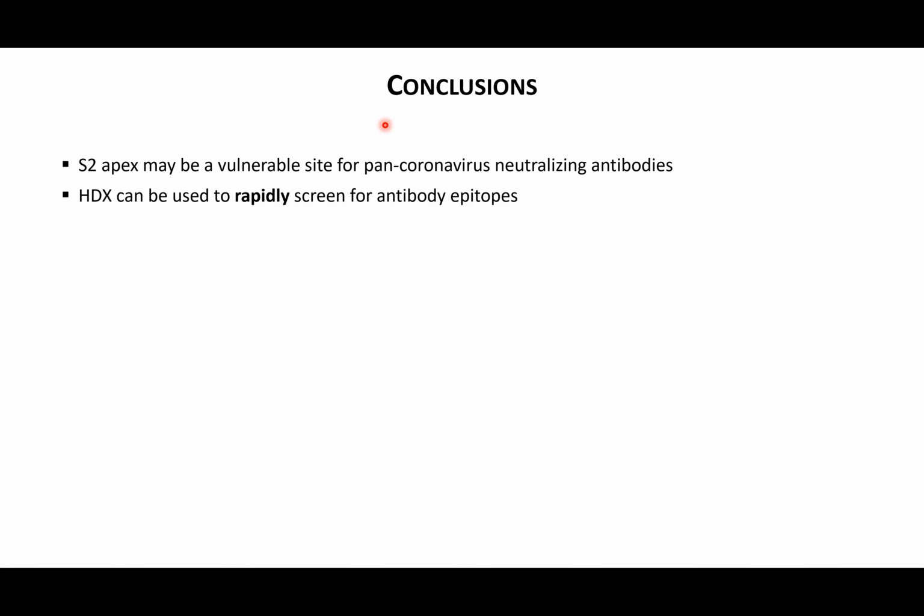Hi, Sheena. Yes, I have a question around pesky glycoproteins, how to deal with the glycosylation. What kind of strategies are there to dig a little bit deeper? Things that I can think of is maybe PNGase F treat the protein before the experiment, or maybe express the protein in the presence of an inhibitor like kifunensine, or are there different enzymes that you can use to give you different cleavage? What's your experience there?